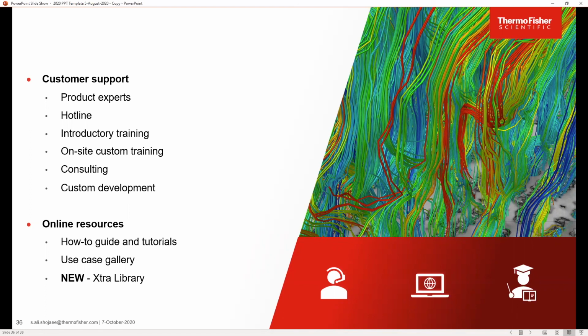It's like a collection of everything that you can do with the software, like examples for segmenting the image, generating meshes for digital volume correlation, an example of how to get the volume from a fiber, and many other things. This library that we have recently launched is a very great resource, and it's evolving fast, and there's always something there that would be useful for you.